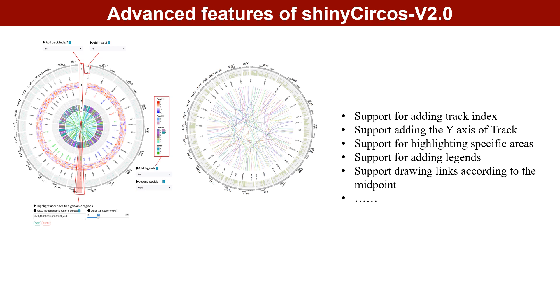In ShinyCircos v2.0, users can now add text labels to indicate the index of all tracks. Specific genomic regions can be highlighted. A y-axis has been added for supported tracks to indicate max and min values of the input data. Users can also add a color legend and use the midpoint of the link to draw links, etc.